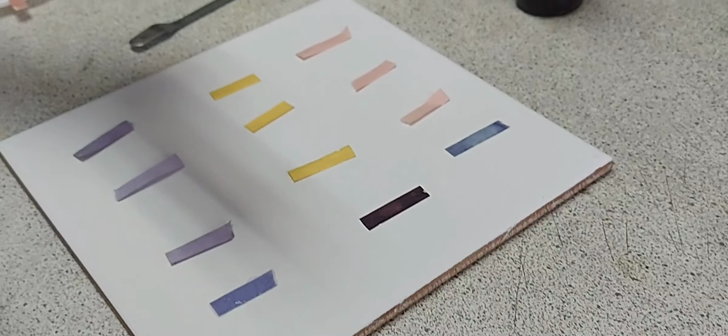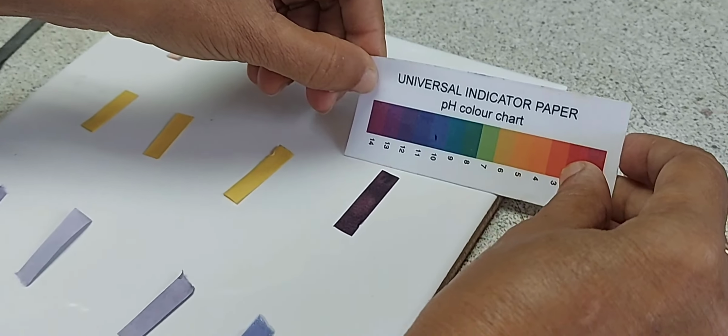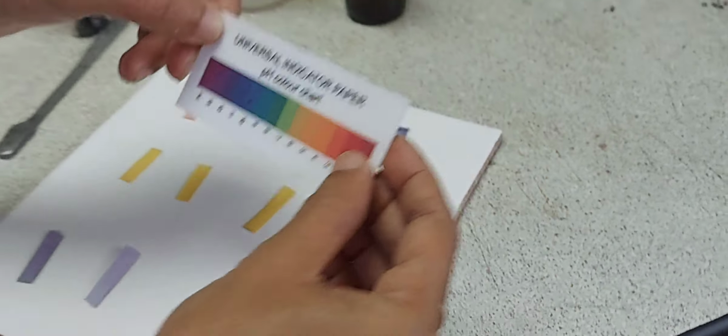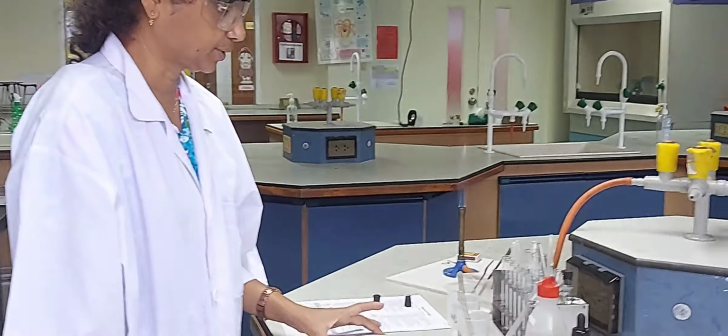Take the pH, and you can see that it is purple, so it is 12. pH is 12 for sodium hydroxide. Red litmus turns blue, blue litmus remains blue for sodium hydroxide.